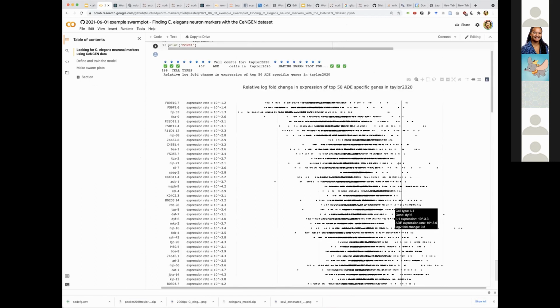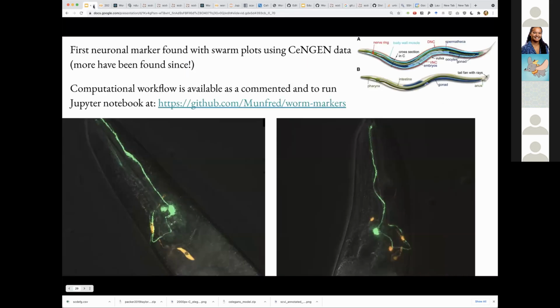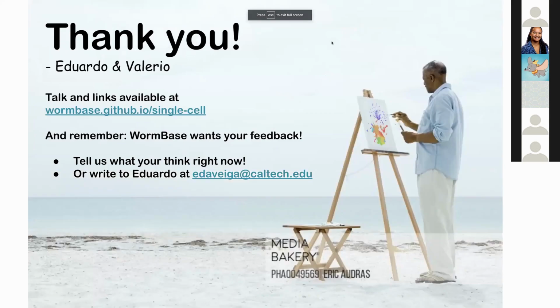And these ones you can trust. These ones are real. You see that I sorted it by p-value. And so it begins with everybody to the left of the black line. And then as the p-value goes down, they kind of start muddling up. So this you can use. The deployment of the app is still in development.